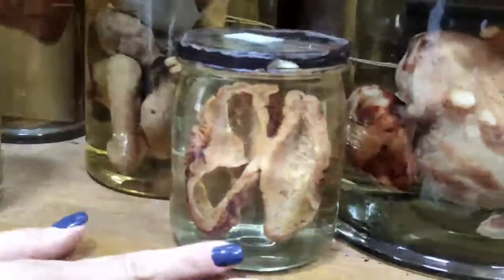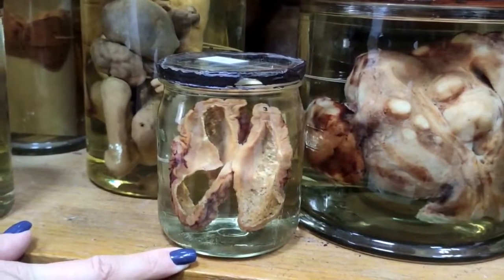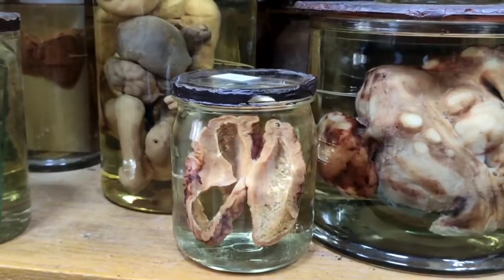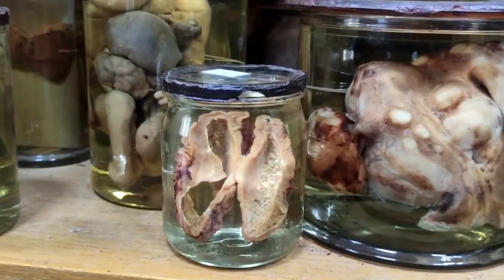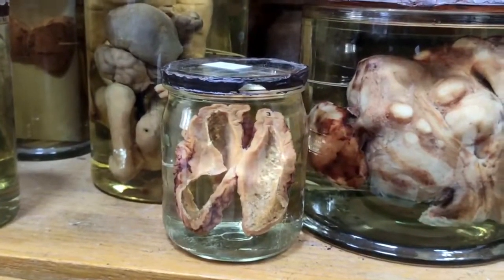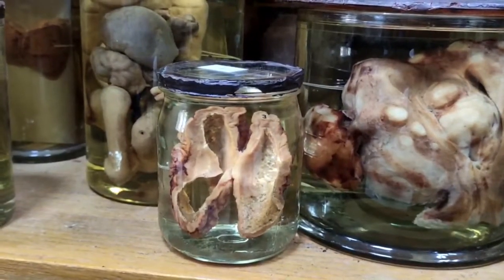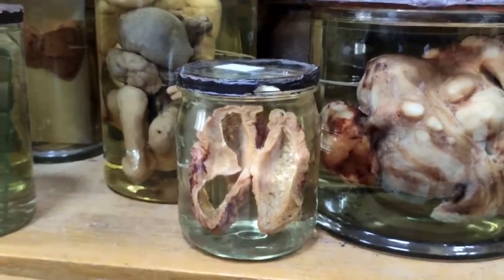And the next one is actually today's topic. This is toxoplasmosis. Toxoplasmosis of the brain. You should tell me that this disease is caused by Toxoplasma gondii. The person, I mean the baby, can be contaminated in a transplacental way, and you should tell me four main characteristics of this condition.